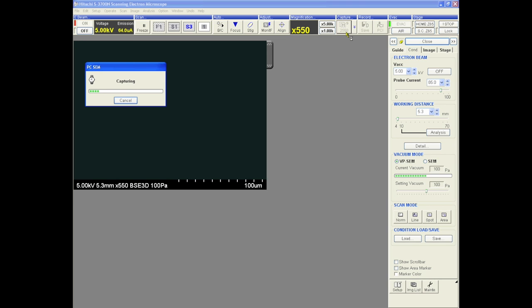At this point, an image should appear. If the screen is too dark or too light, adjust the brightness or contrast with the ABCC or by using the manual dials on the console.